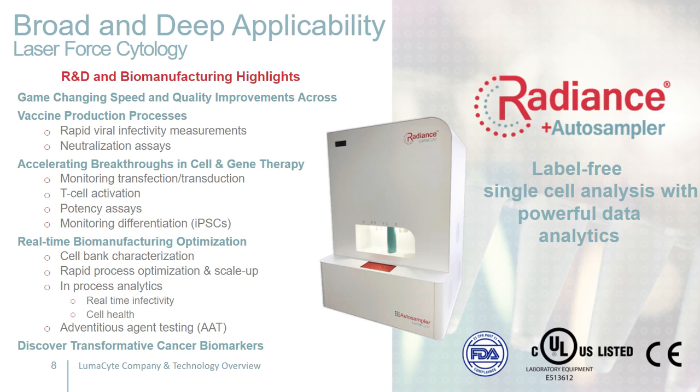In cell and gene therapy, in addition to viral infectivity, right, we've used this for monitoring transfection. Bhargavi will show you a very excellent example of that in her section. We've done work with T-cell activation, potency assays, and more recently looking at iPSCs and monitoring differentiation. And this is where the deformability really comes into play and really shines because, as cells are differentiating, that changes significantly and really helps elucidate these different pathways.